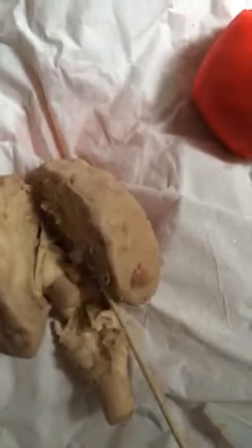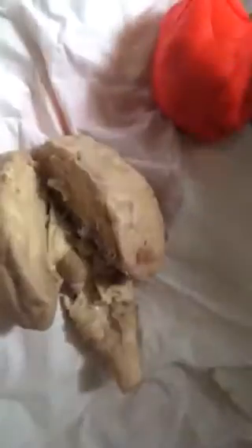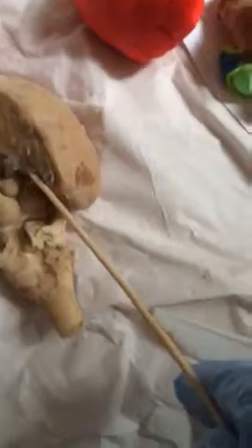Open up the brain. You see these two rounded structures right here would be the... I open my brain over here also, we're looking at the thalamus. And in between the thalamus, you'll see the pineal gland.